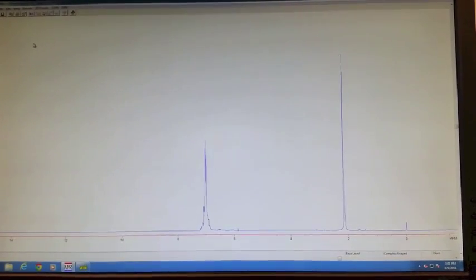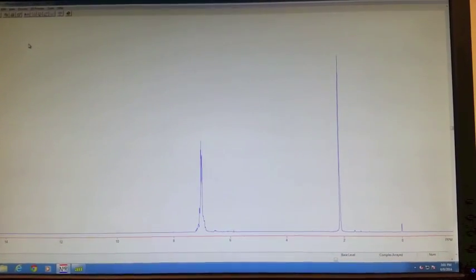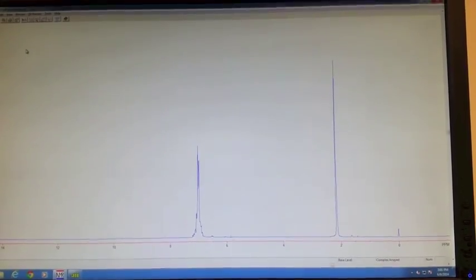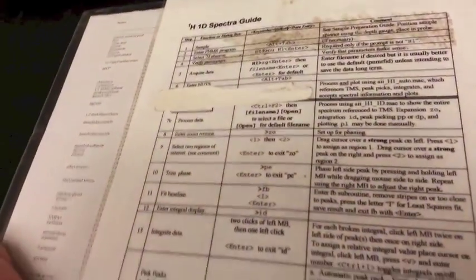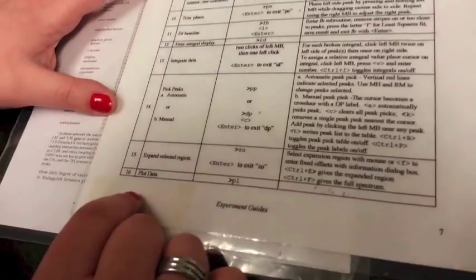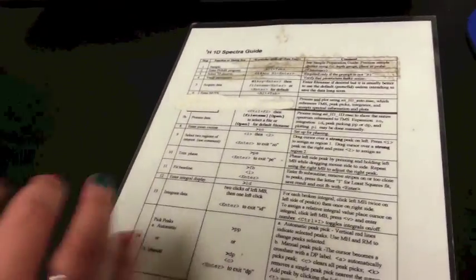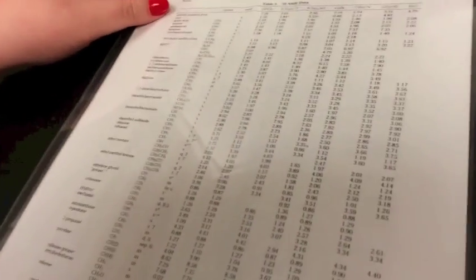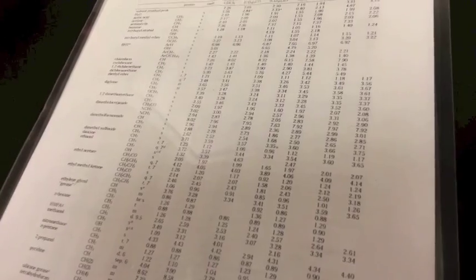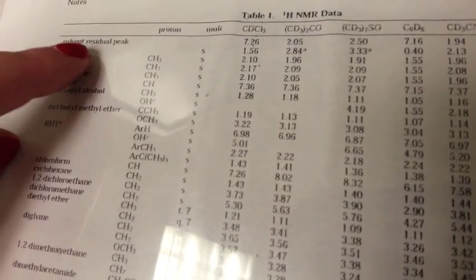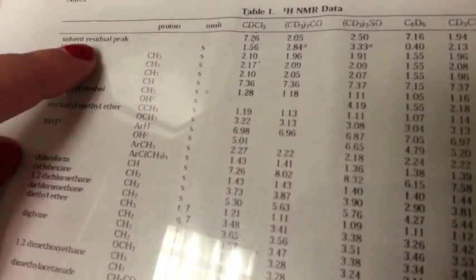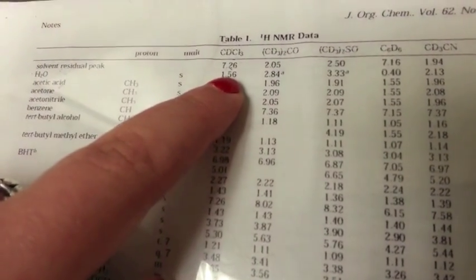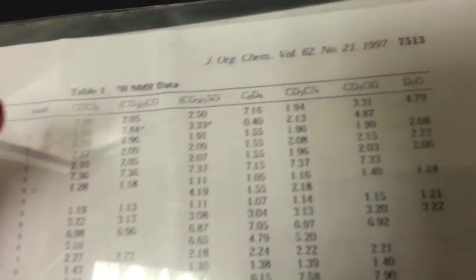If you don't have your instructions for the day or you're having trouble remembering something that you need to do, there's always this handy NMR spectrum guide that will show you all the steps that you need to take in order to take an NMR spectrum. This is always located near the NMR. Another common problem is that sometimes a peak will show up and you're not really sure what it is because you don't think it belongs to the compound you're looking at. This chart shows you both where peaks from your NMR solvent will show up, and other solvents that could still be contaminating your sample.